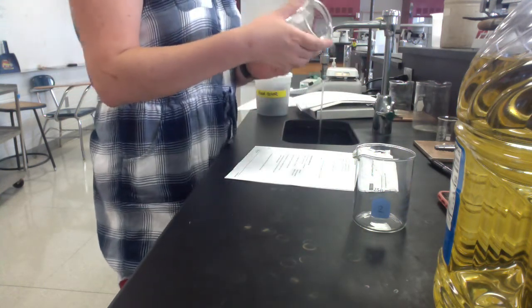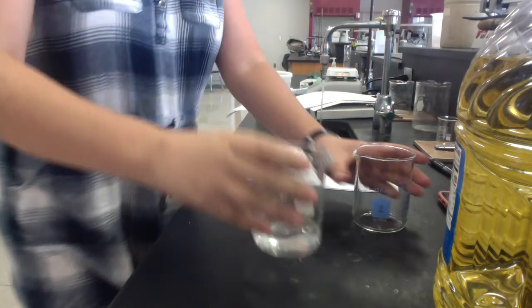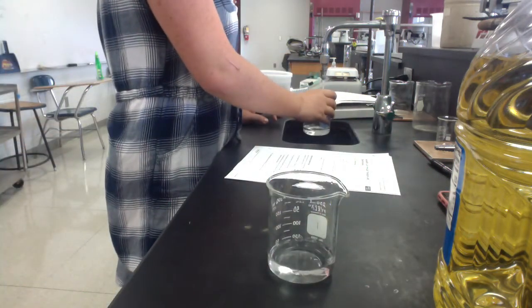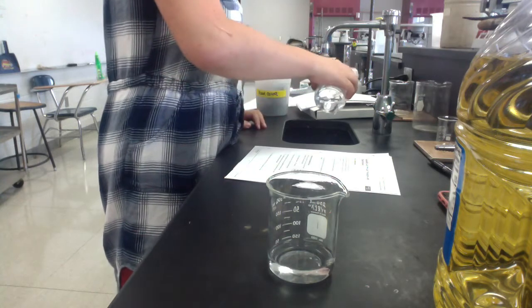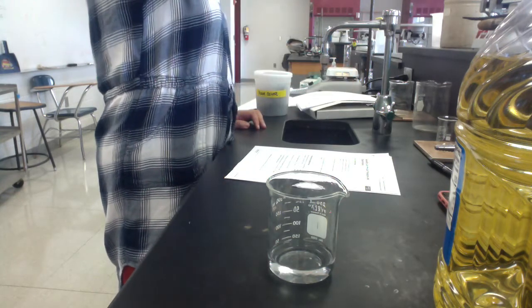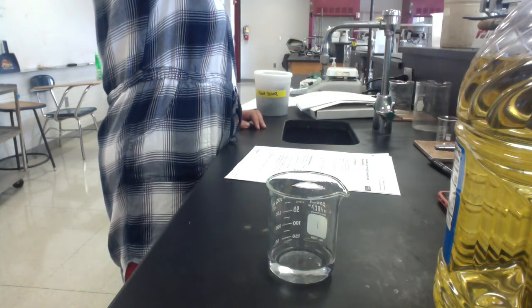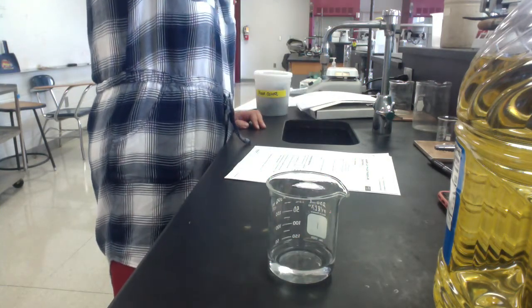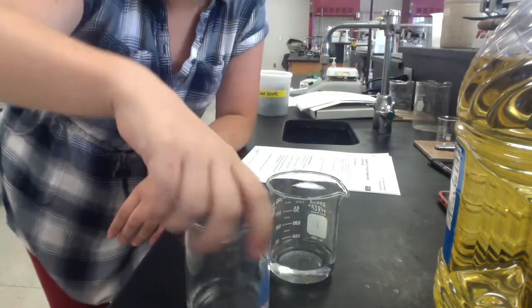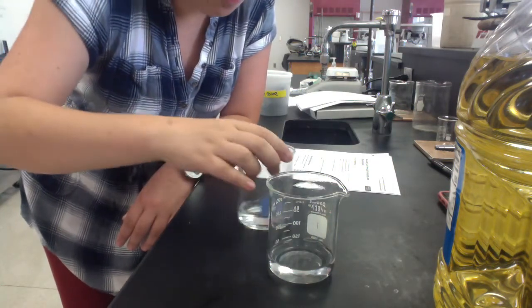Okay, so the first thing the lab tells us to do is to fill our beakers about a quarter of the way with water. So my measurement is about 200, and so I use about 50 milliliters, right? This is not exact because I'm using a beaker, but that's okay. Let me fix that a little bit. So both my beakers are about at 50 milliliters. Not perfect, but about.